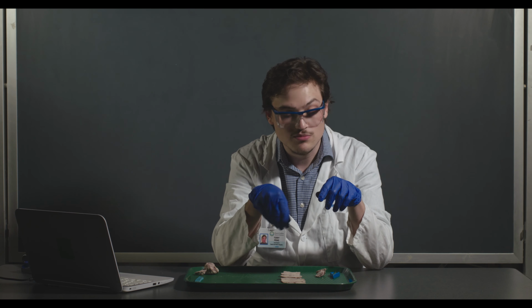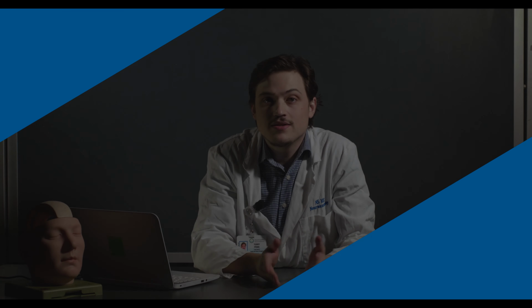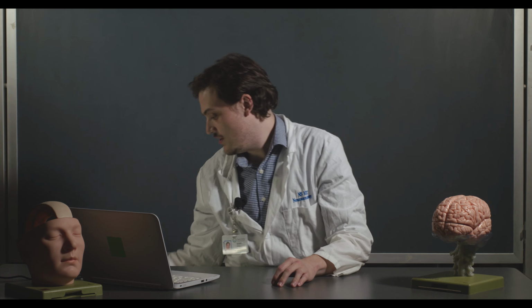And at this point, we're going to transition back, after I clean this up, to the human brain model so we can see some of the same structures that I pointed out here. So that's the sheep brain dissection. Now we're going to transition to just showing some of the same stuff that you saw on the sheep brain on a human brain model.